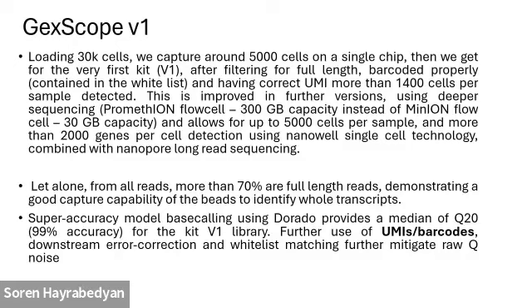When we use the bigger flow cells of Oxford Nanopore, we can get up to 5,000 cells and up to 2,000 genes per cell, which is, I think, a very good start. We haven't tested your HD new chips yet, so it's about to happen. We can share this information later when we test. This is with a very early version.